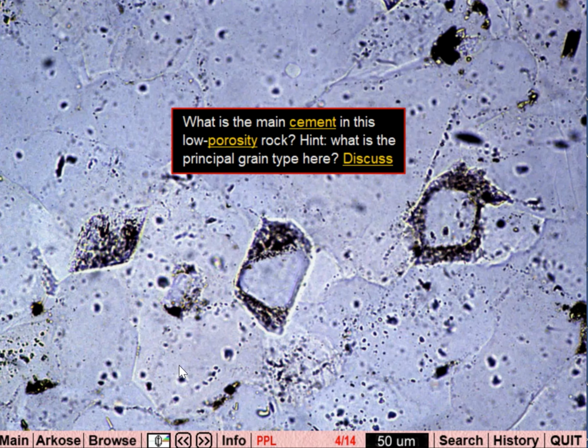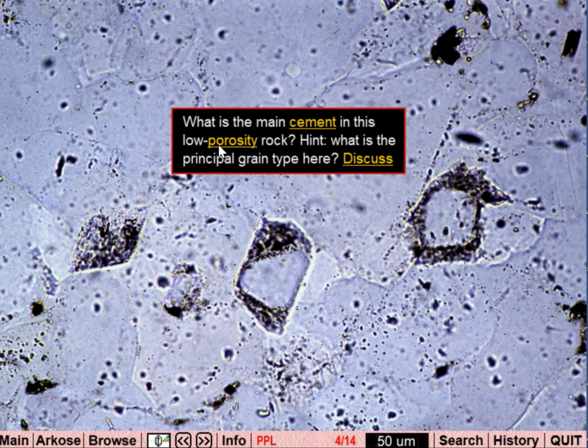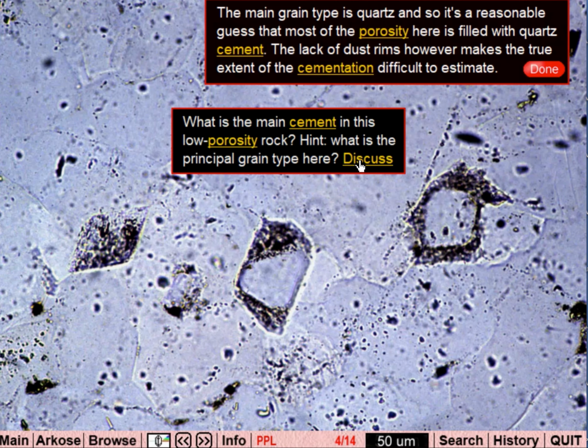Okay, this is a sandstone that has a lot of quartz in it. It's almost fully quartz. We can see some grain shapes, some rounded grain shapes in some areas. You can still see the grain outlines, but in other areas, it's really hard to distinguish the cement from the quartz.